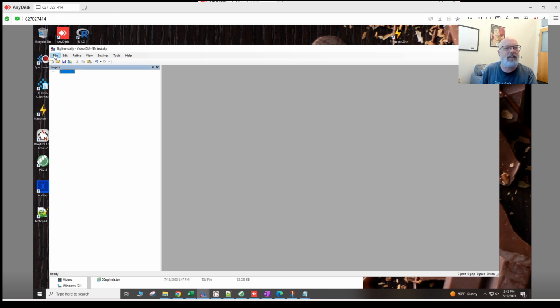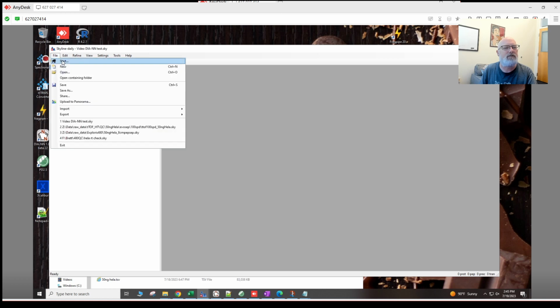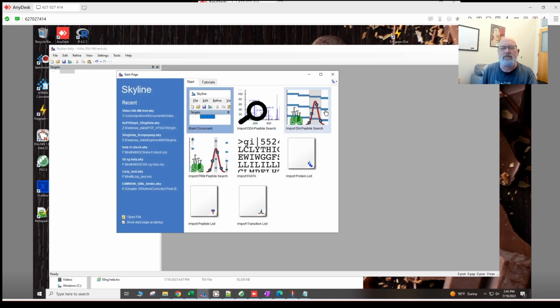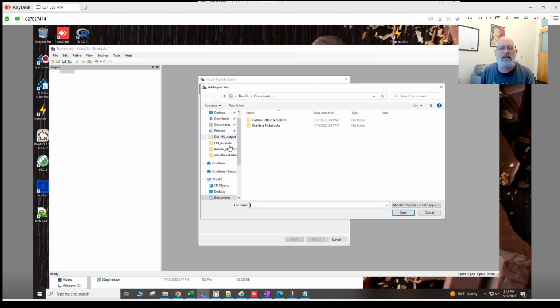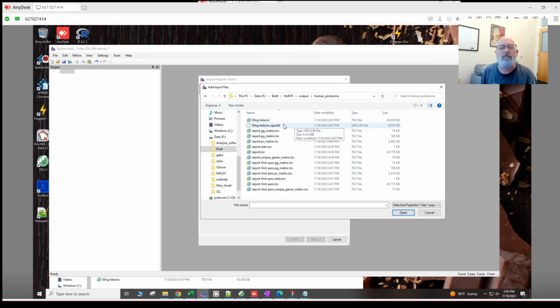Okay, so let's do that again. Go get new document, or we'll go start, import DIA peptide search. We're going to give it that speclib file again, timsTOF HT, output, human proteome. We'll give it the speclib file.